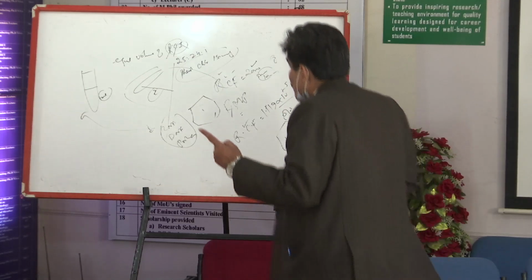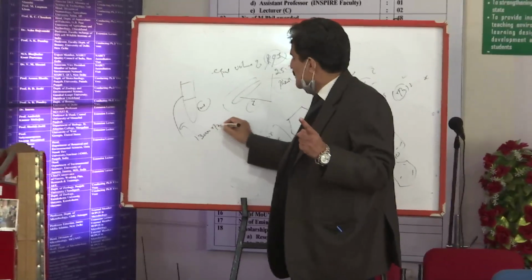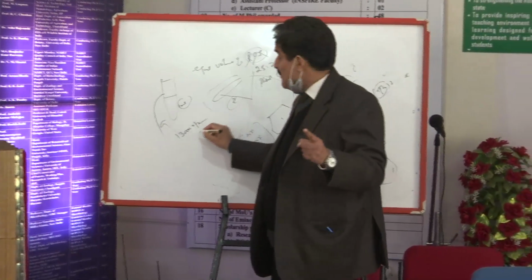Then you spin it at 13,000 RPM for 1 minute only. There will be separation of the layers.